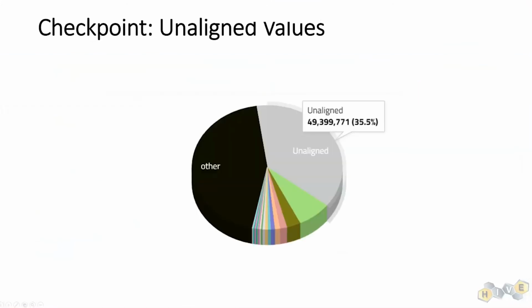And just a couple of quick things to be aware of. If you see a really high number of unaligned reads, that's probably not good for most experiments, and there might be a problem. I think you can see as high as maybe 20% or so, and it could still be okay, again depending on what you're doing, because there can be issues with read quality, and some reads get flagged for ambiguity or other reasons. But if it gets up to almost 40% or higher, that might be too high, depending on what you're doing.